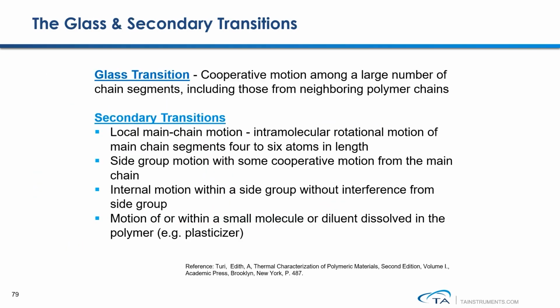This rheological temperature ramp method is most sensitive for the measurement of polymer chain relaxation and polymer transitions. For the glass transition measurement of a highly cured or highly filled system, using this rheological method is a lot more sensitive compared to using a DSC method.